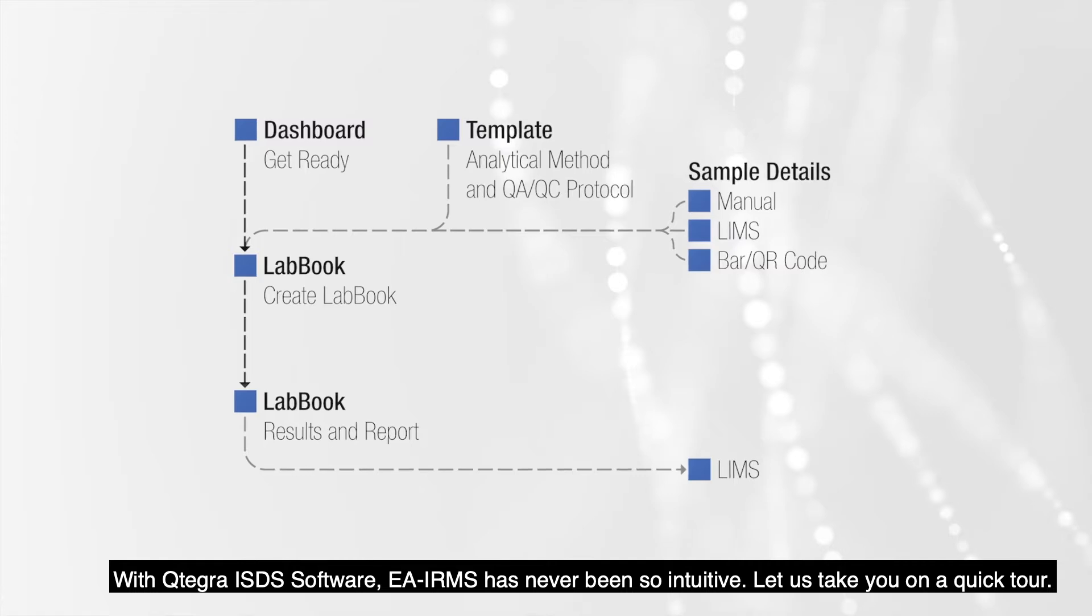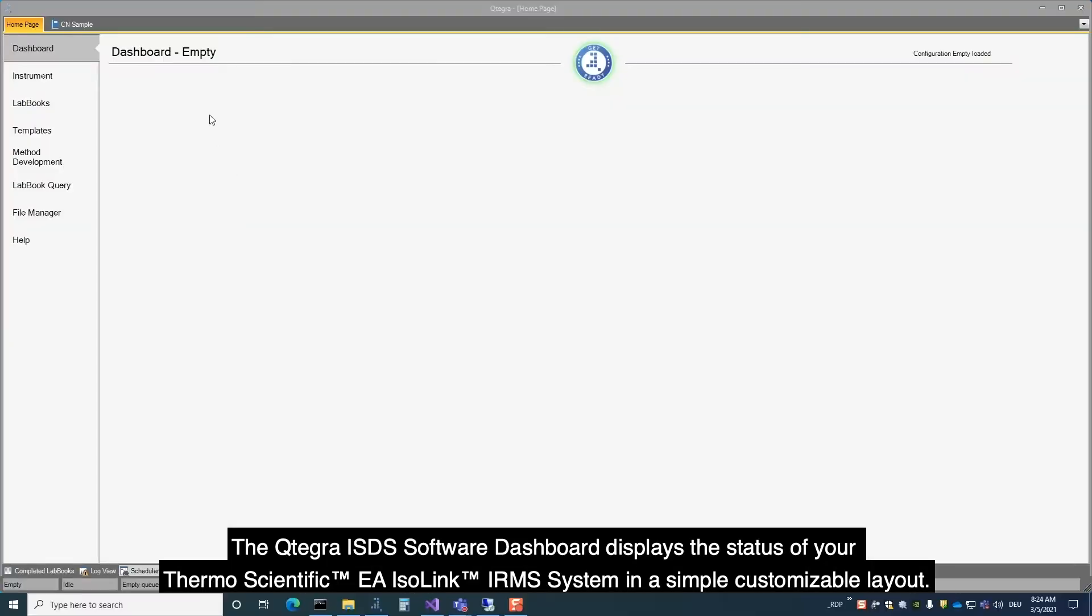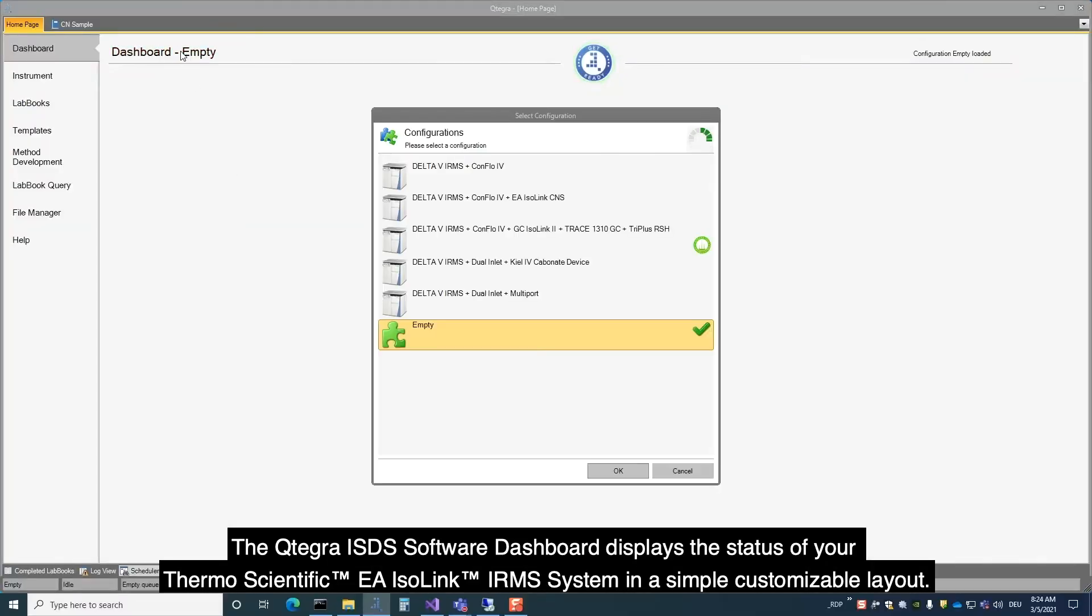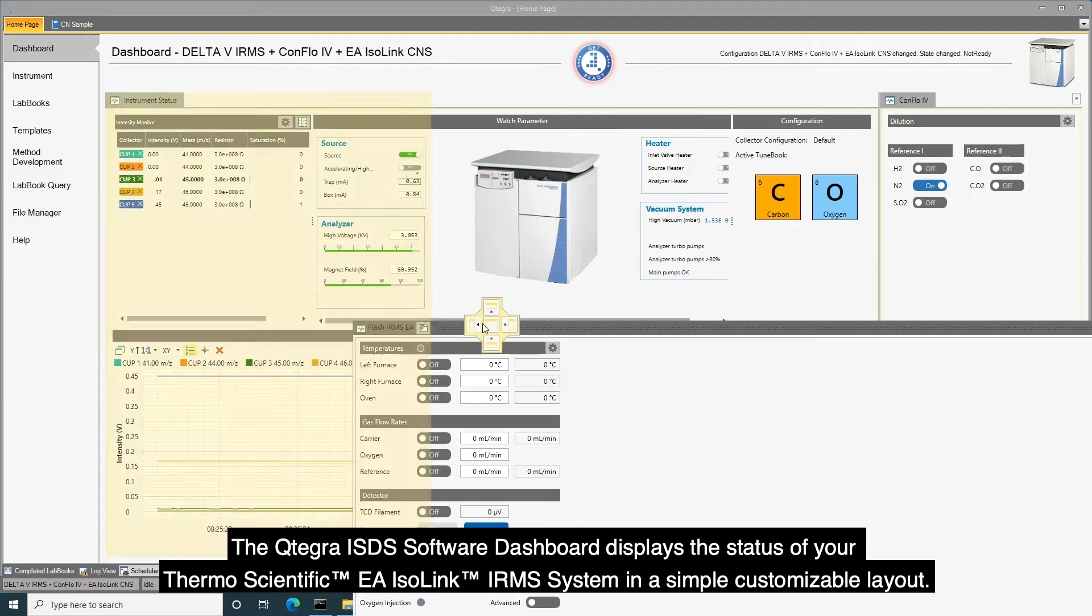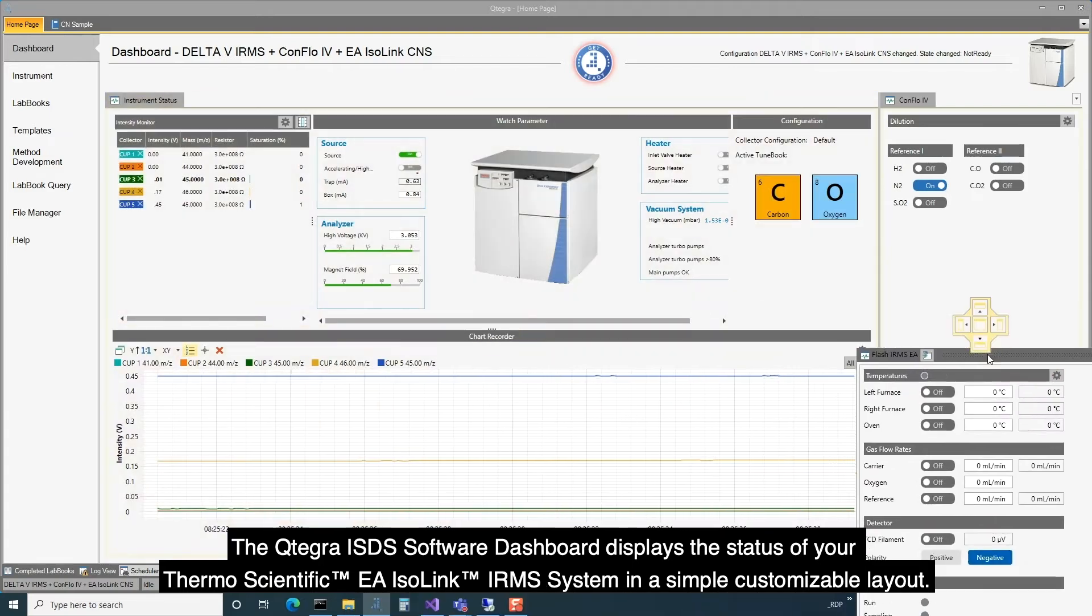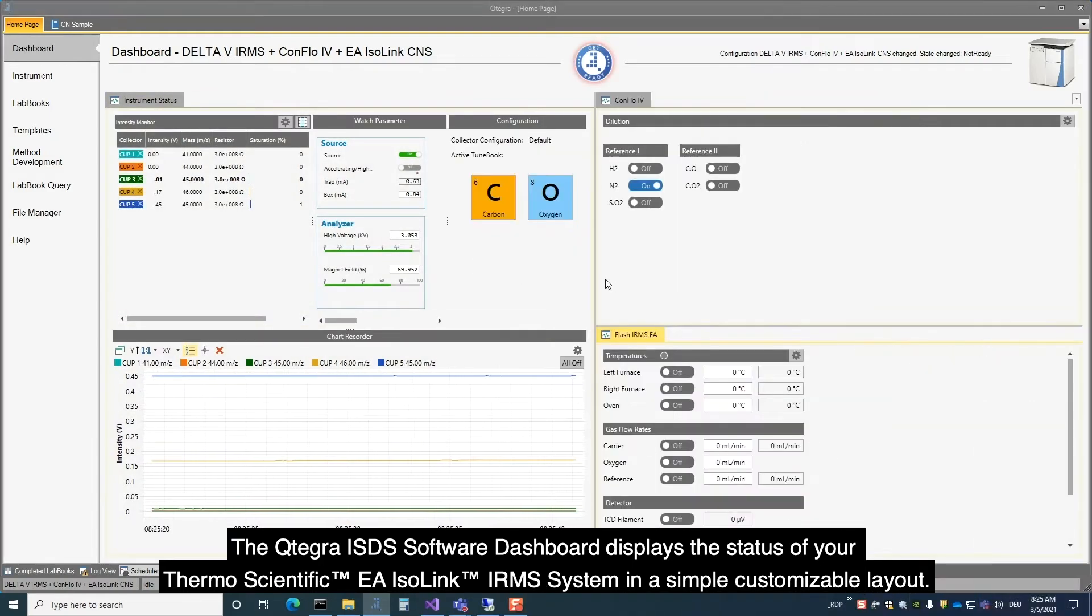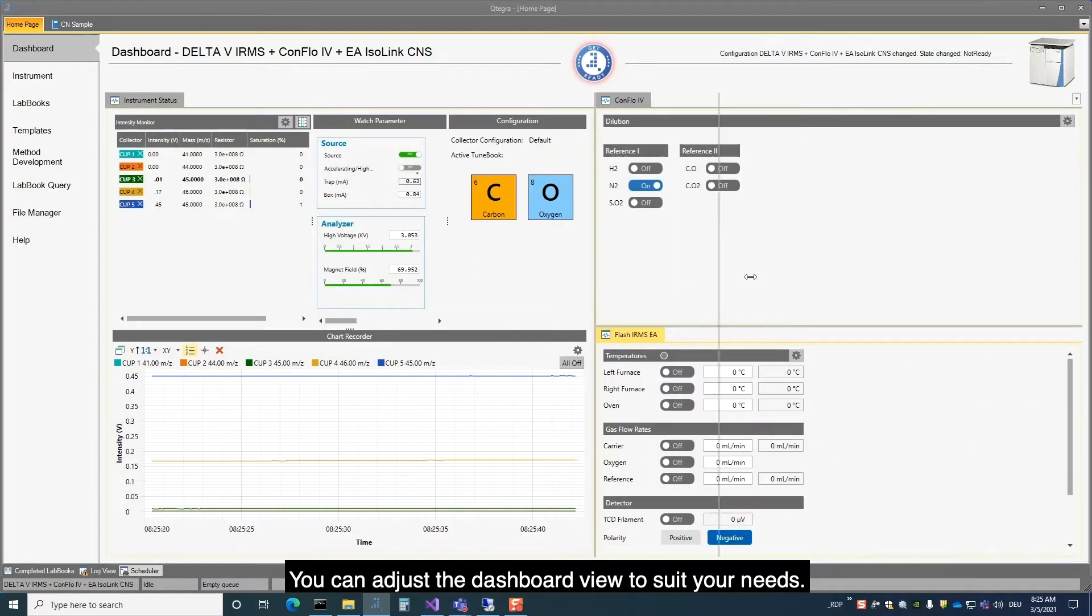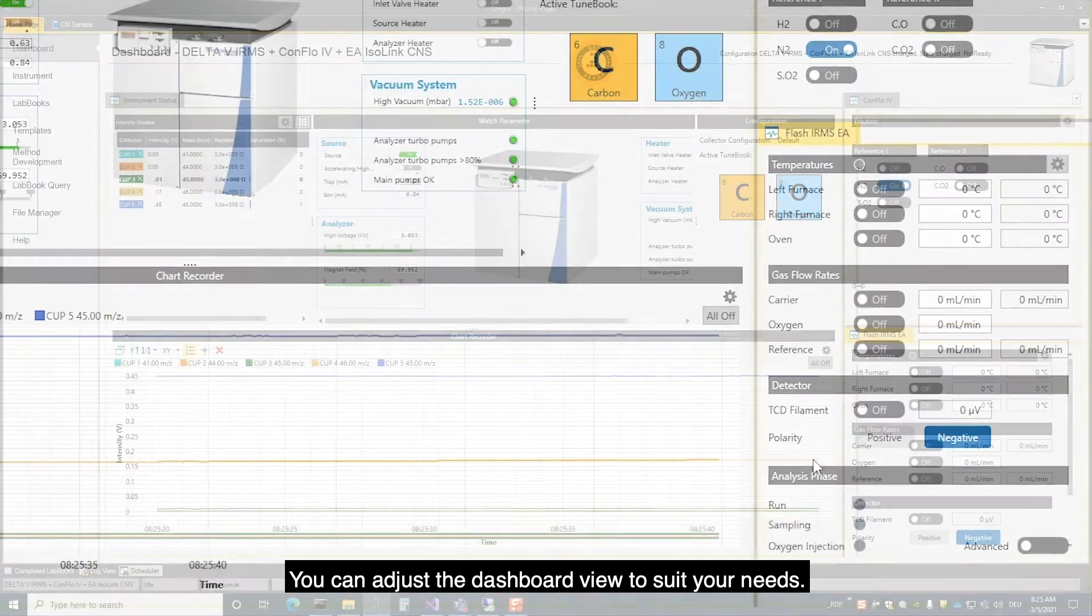Let us take you on a quick tour. The Qtegra ISDS Software dashboard displays the status of your ThermoScientific EA-Isolink-IRMS system in a simple, customizable layout. You can adjust the dashboard view to suit your needs.